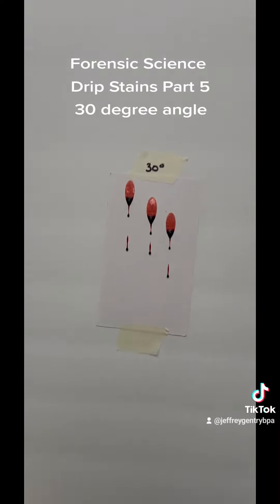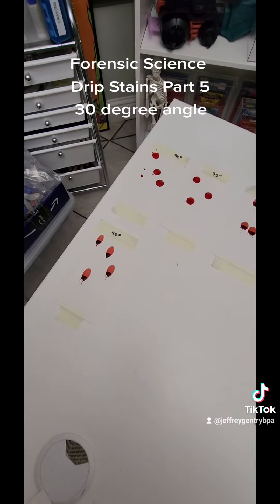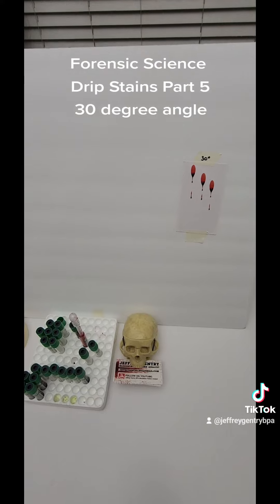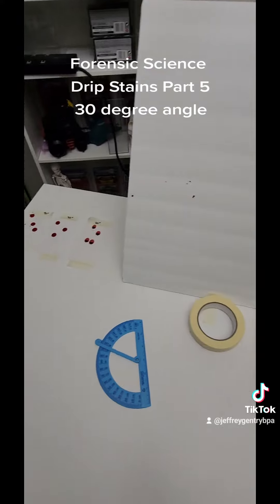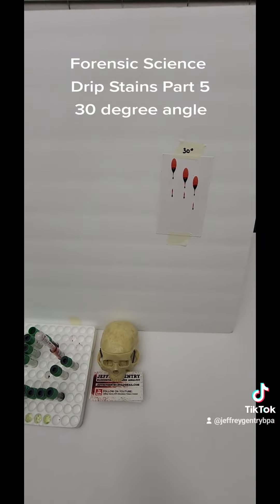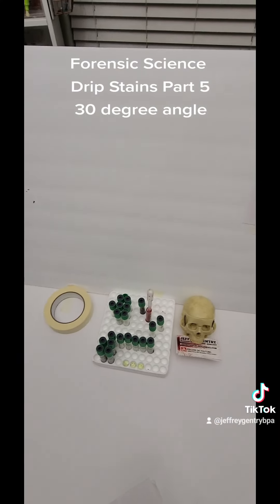These came out perfect. I'm glad I didn't make a mess all over my table. Once I get done with all of these, I'm going to let them dry and I might even laminate them so I can use them as a reference for teaching. This is how you create drip stains at different degree angles of impact. Drip stains can obviously be created on any surface — tables, floors, walls, whatever surface somebody's dripping blood onto. This is Jeff Gentry, BPA, blood stain pattern analyst, showing how you create drip stains at different degree angles of impact.